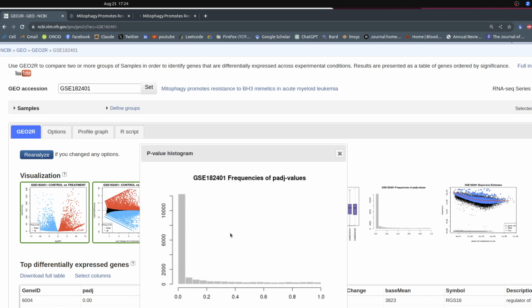So if you look at in here, what you see is that the p-value, the more reduced, the differential expression genes are more concentrated in this area. When the p-value increases, the genes in this area probably don't have differential expression value as expected. So we will be mostly concentrating on these values when we are looking at the data.